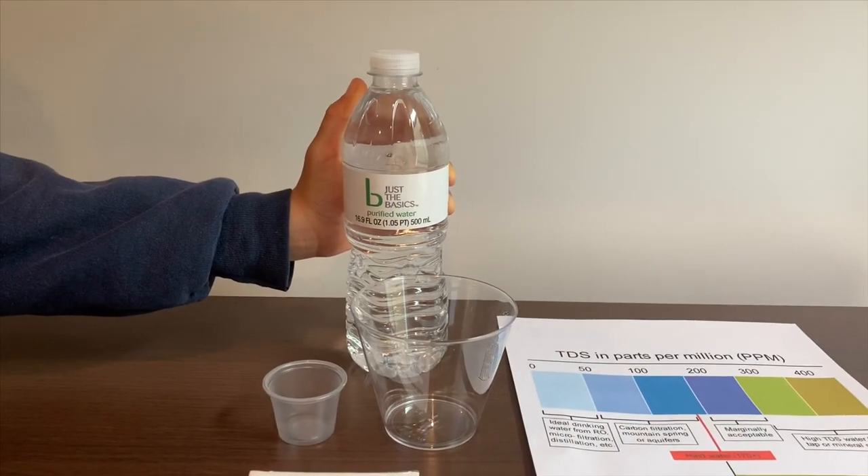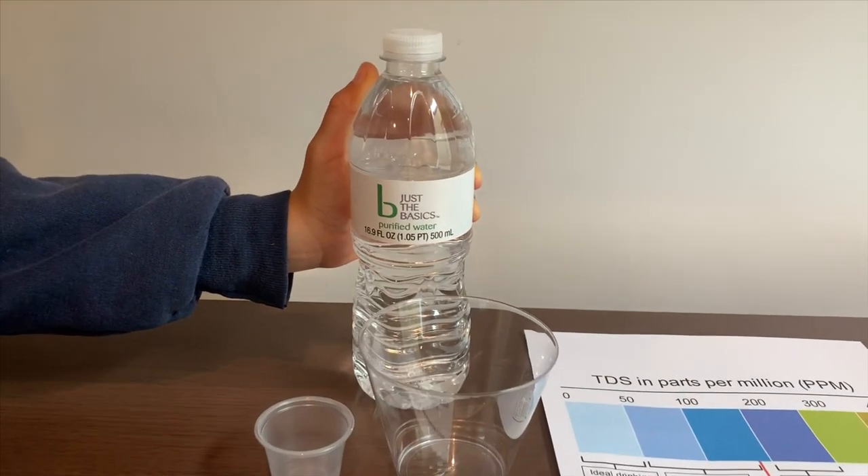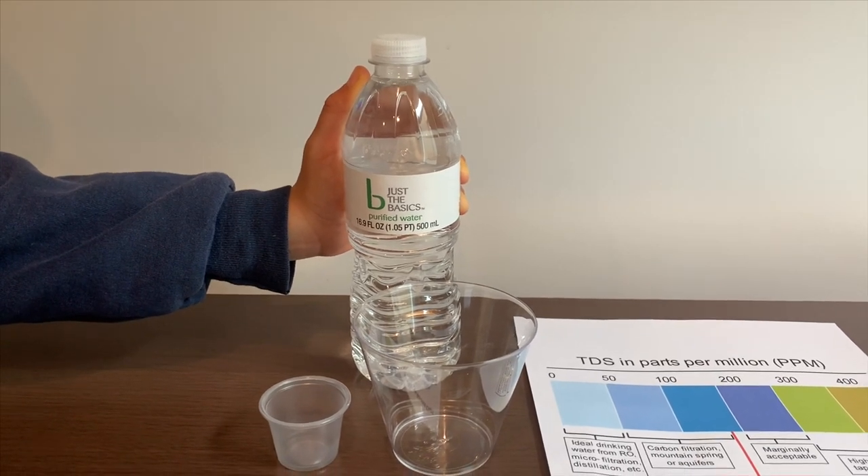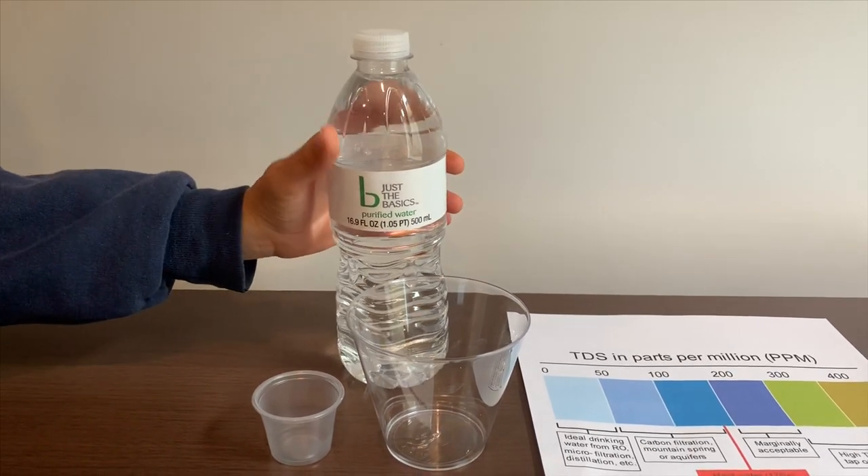This is just a basic purified water. We got it in a pack of 24 from CVS. It cost $2.99. Let's test the TDS and pH levels.